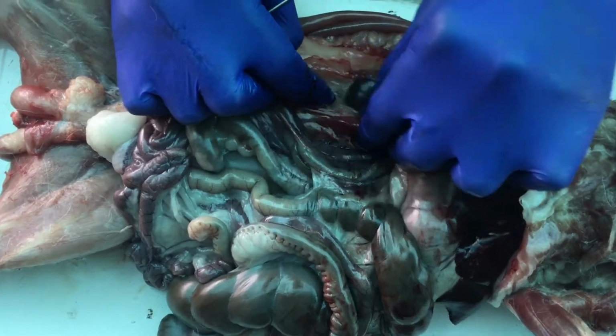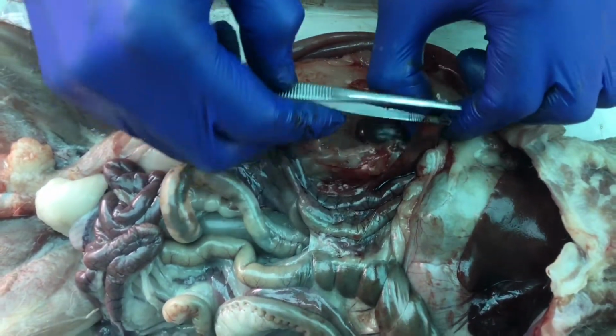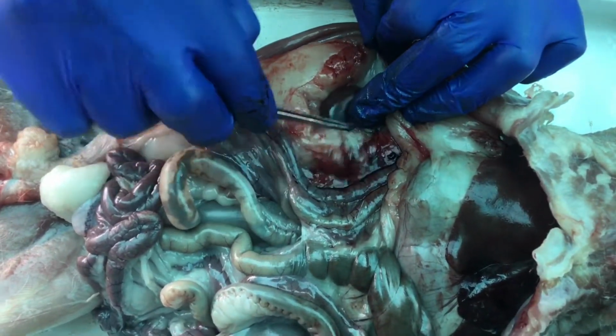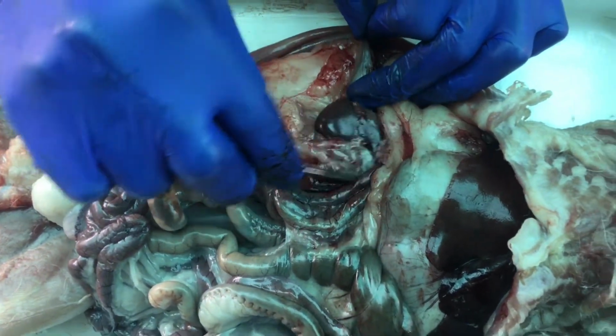And if we go ahead and dissect them out a little bit, you can see how I have to take the, there I'm pulling away the parietal peritoneum, or that serous lining, away from the kidney, and now you can see the whole kidney on the right side.